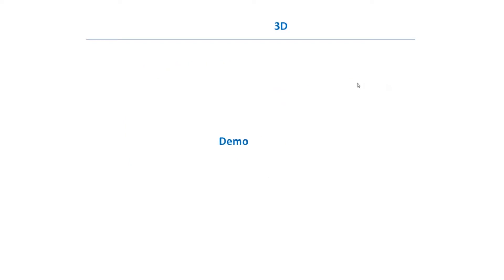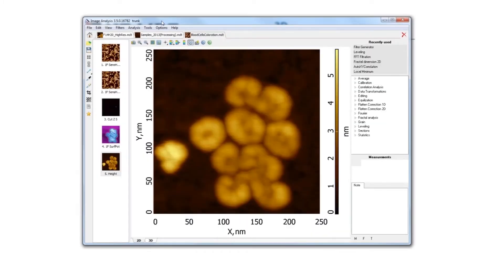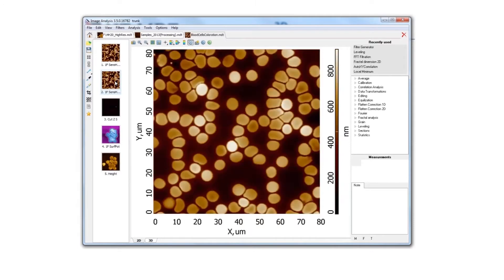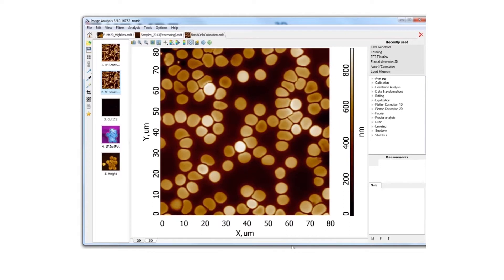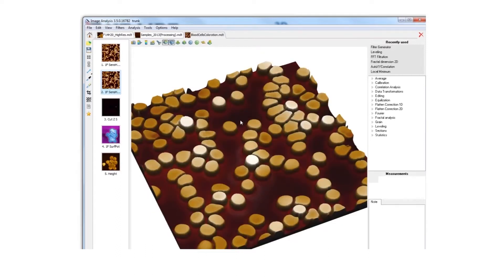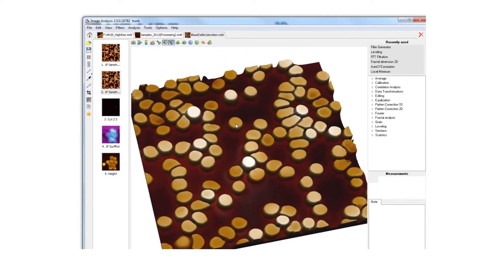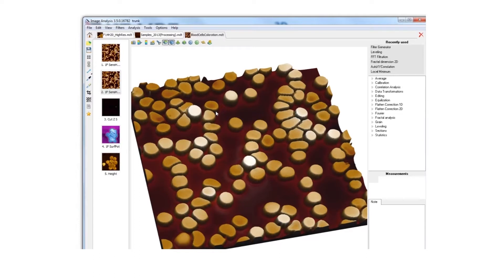Let me show how to do 3D processing. I'll make a bigger image. If I press the 3D tab, I can see a nice image of blood cells, and I can rotate them by dragging.